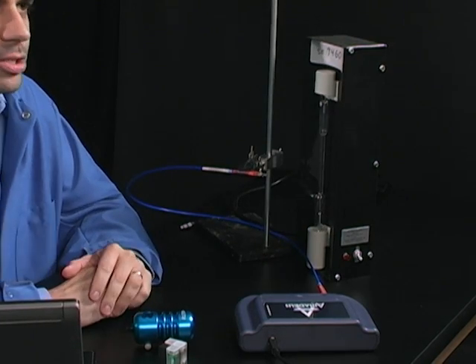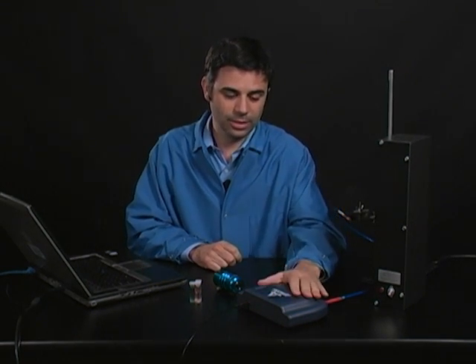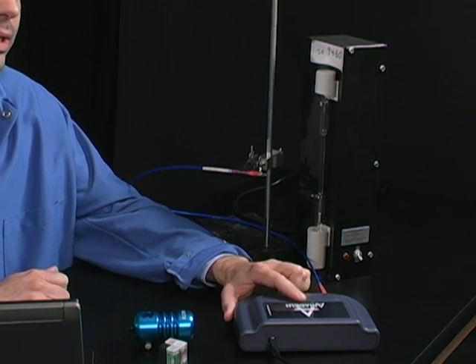So a spectrometer is essentially a very fancy prism or diffraction grating, and it takes light and separates that light into its various wavelengths, and it can measure the intensity of those wavelengths, and that's where it gets interesting for us. So let me show you how we can use our introductory Amadeus spectrometer from OceanOptics in a chemistry setting.